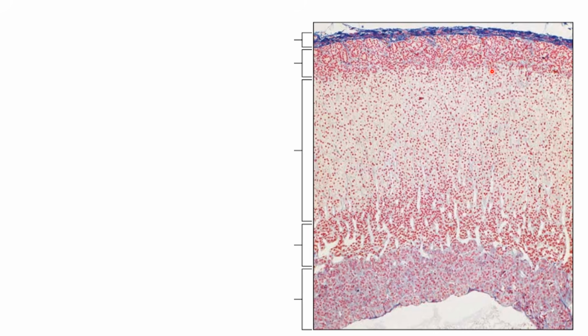So the adrenal gland has a lot going on with it. Like I said, I recommend learning things in layers. So the first layer of information here is the outermost layer is the capsule. That is connective tissue. That's not doing anything with hormones. That's just a little wrapper so it doesn't fall apart.